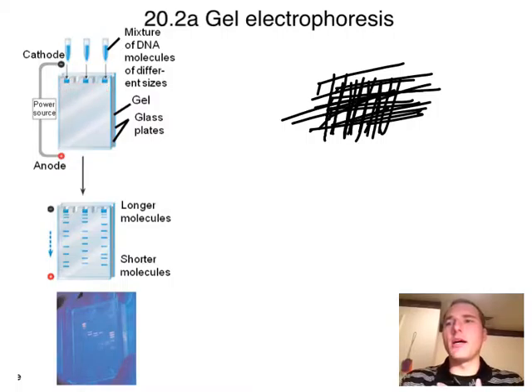If we go back to my experiment with the bird malaria, after the PCR was done, we had these little tubes, and we hoped that we had made copies of the malaria, but we weren't sure if we had made copies of the malaria genome, or the gene that we were looking for there. And so what we did is we loaded it into the ends of the gel, and this would have been laying flat on a table, so you're looking straight down on it, and we load these things in here, and then we run electricity through the liquid that they're in.